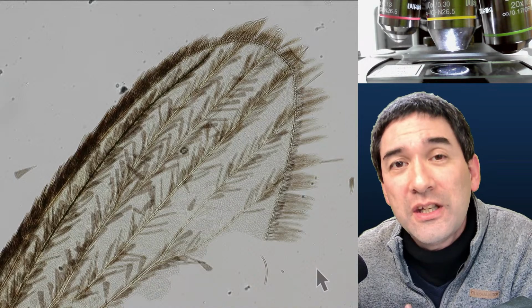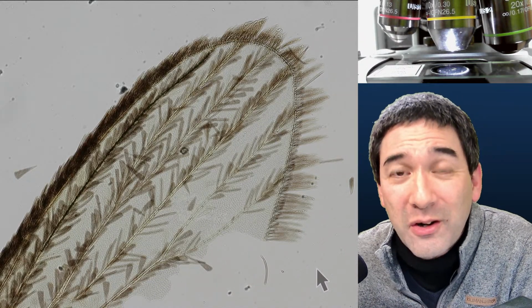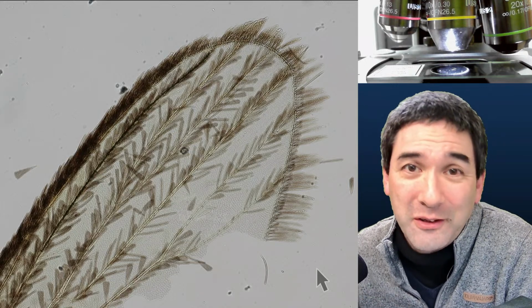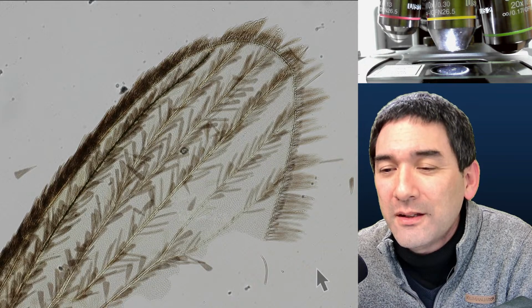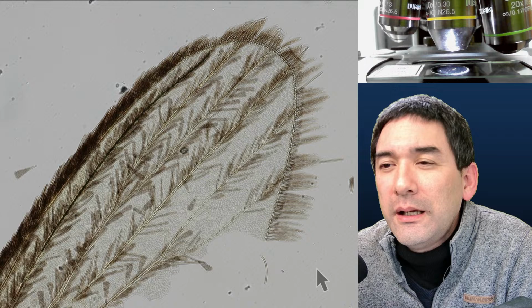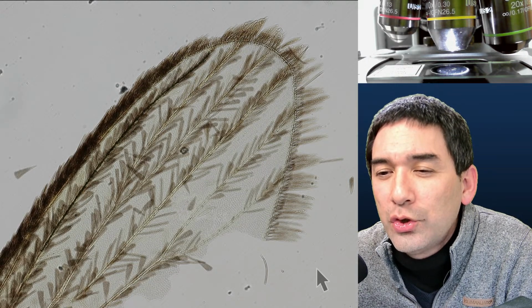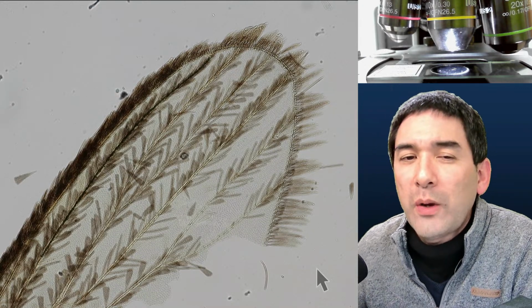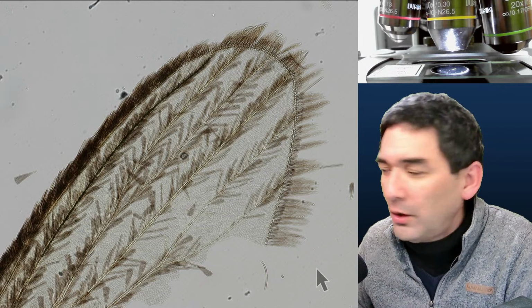If you look into nature, you see there is such a big diversity of living things. And sometimes there are different ways the same problem can be solved, and as long as it works. I think it's an interesting question, though. Okay. Could you do a lens resolution showcase? I'm not quite sure what you mean. Basically, do you mean that I go up all the way with the magnification? Yeah. I'm a little bit confused by the question.